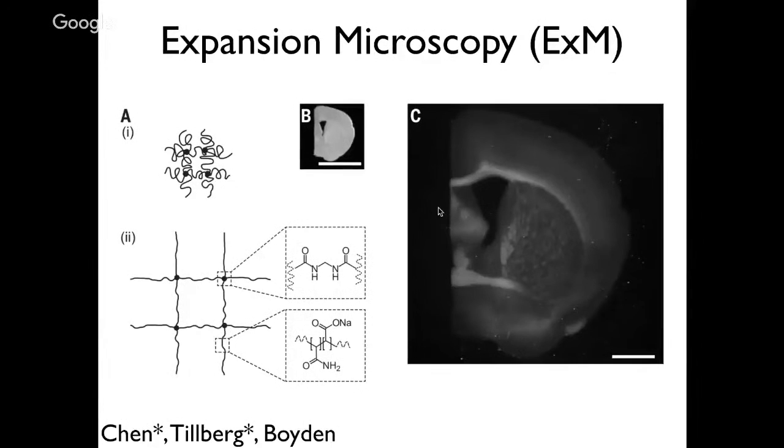But basically, I was fortunate to be in the loop at that time with Ed Boyden's lab as well, which had started developing a totally different approach to increasing the spatial resolution of any kind of optical observation of hunks of intact 3D brain tissue. And the new approach is called expansion microscopy, and is basically just that. It basically means physically making the brain itself larger, rather than trying to essentially make the light smaller. You take the same microscope, but you physically swell the brain.